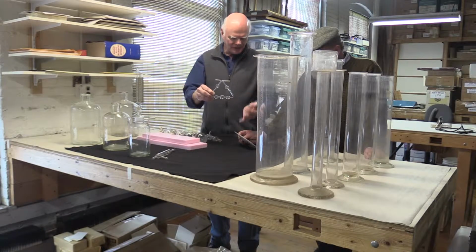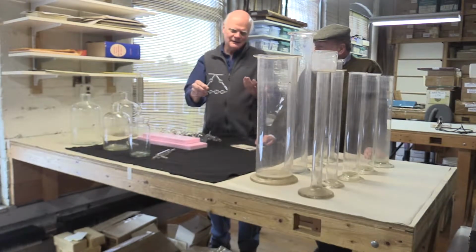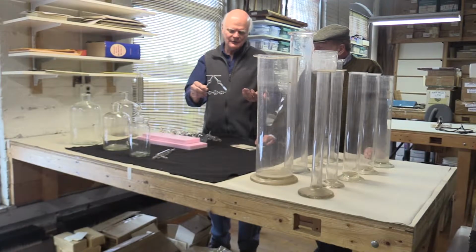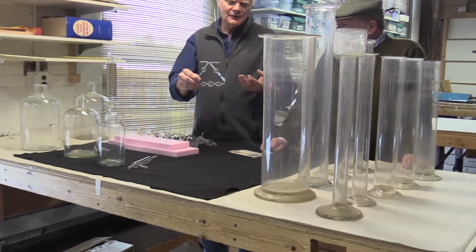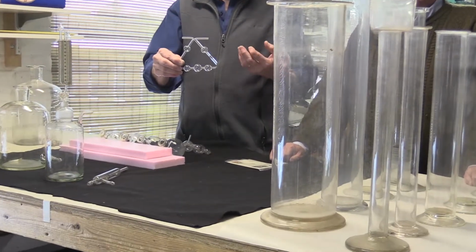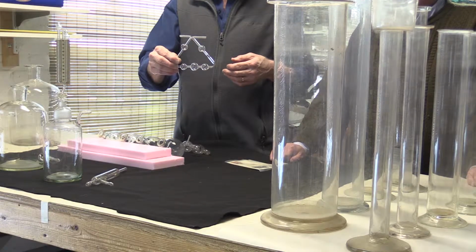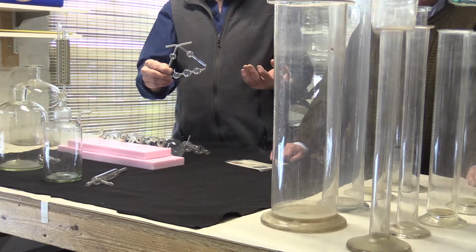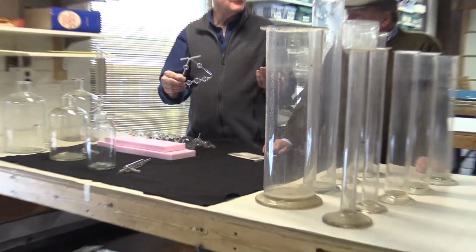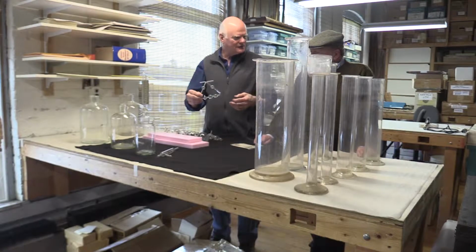This must have been a very important apparatus to have made its way into the American Chemical Society logo. It changed organic chemistry, organic analysis. And Liebig is the German chemist who invented it. His name's attached to it. There were other versions of it. He had a lot of students. He developed the first laboratory at Gießen, Germany, where university students would come and work in the laboratory on their own. So a lot of Americans went over there and learned it and brought it back to this country.